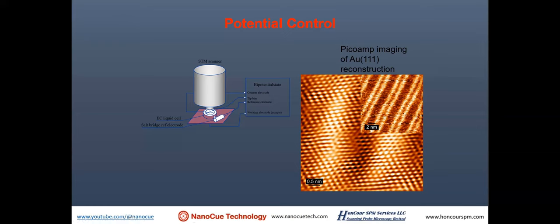The similar thing can be observed when you have a piece of gold on a silicon substrate. You could also image it with AFM. Then you could anneal the surface with a hydrogen flame. As you observe, you can see that the surface of the gold will start to form these interesting herringbone structures. That's the reaction happening as you observe it.